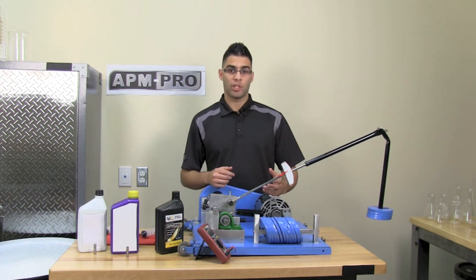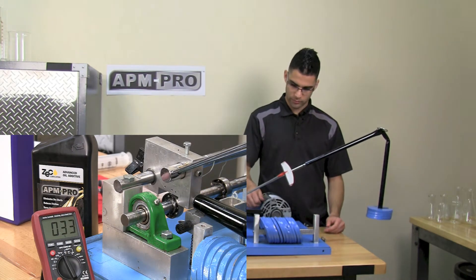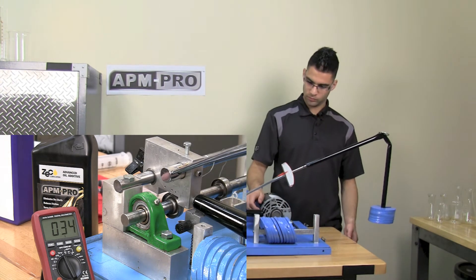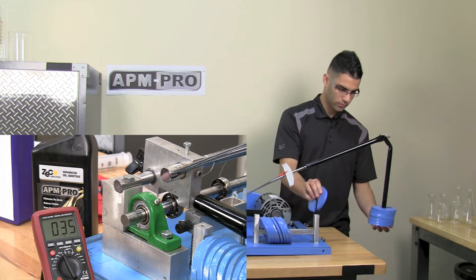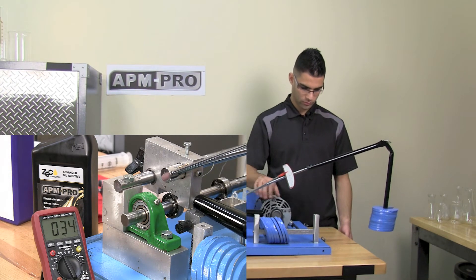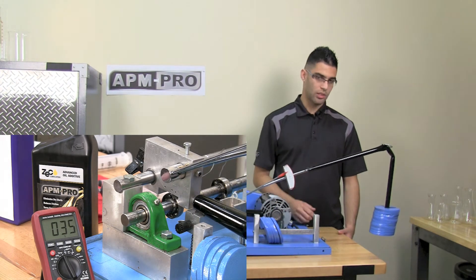Now I will remove the oil bath to simulate dry starts. We will begin the dry starts at four weights. It stops at 11 weights.